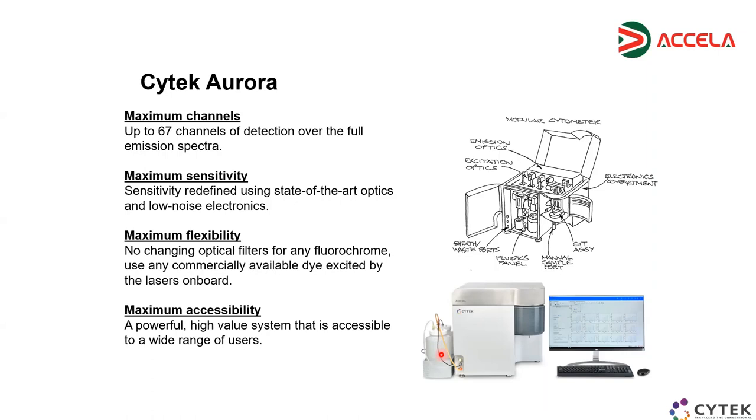There were different unstained controls. And the idea is that you can also use beads and cells as a control. The important thing is that the spectrum of the beads is comparable to the spectrum of the cells. So you don't have some kind of big autofluorescence from the cells, you mean? Exactly, you are matching the spectrum. In conventional flow cytometry you don't have control of this, and sometimes people mix beads and cells as a control. So in this case you have a quite nice verification: if you see that the positive beads have the same spectrum as the positive cells, why not use the beads as a control? This can also help you in the separation.